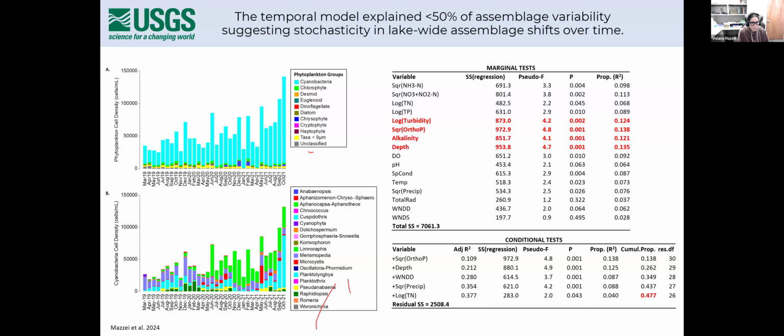But they also use mass spectrometry, right? It's going to be a lot more accurate, but it's also a lot more expensive and time consuming, which is why it's taken so long for the Lake Okeechobee work. We have a lot of the ELISA data back, but it comes in random order and it's not complete. So we're waiting for everything to be finalized, but we'll have ELISA data, the mass spectrometry data, and also some proteomics data.